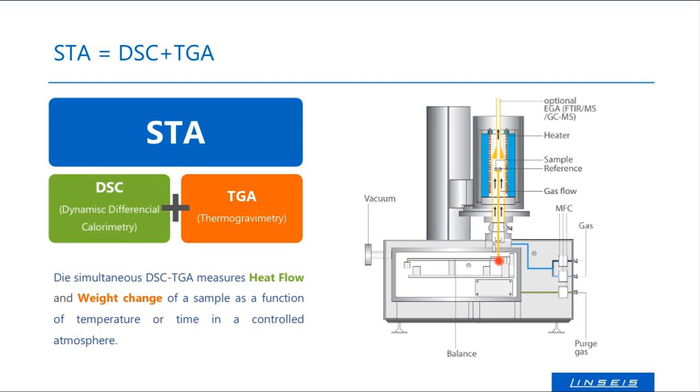As I told you, the measurement system, or the sensor, as we call it, is positioned at this point, so it's fixed with the balance bar at that point, and then it's a rod that goes into the furnace, so the hot zone, the reaction chamber up here. The blue bars here symbolize the heaters.